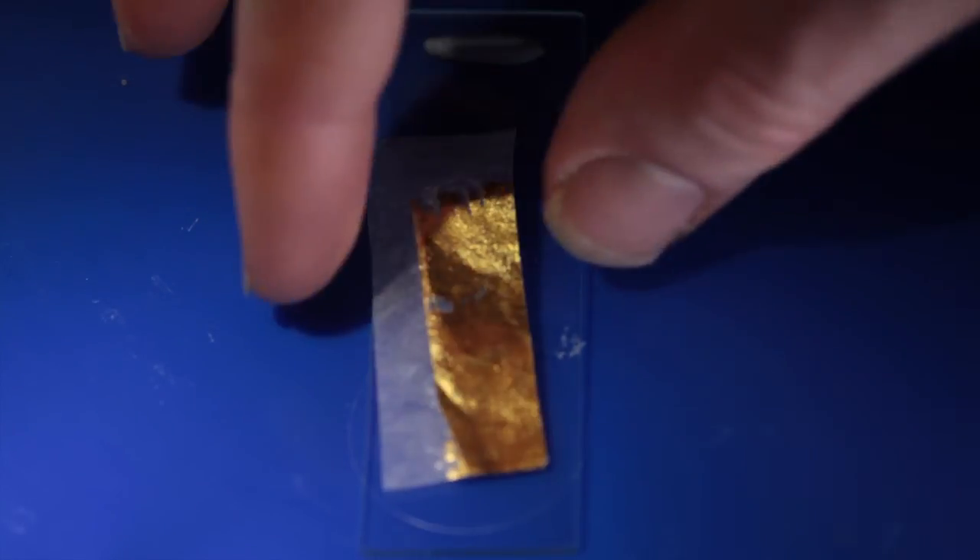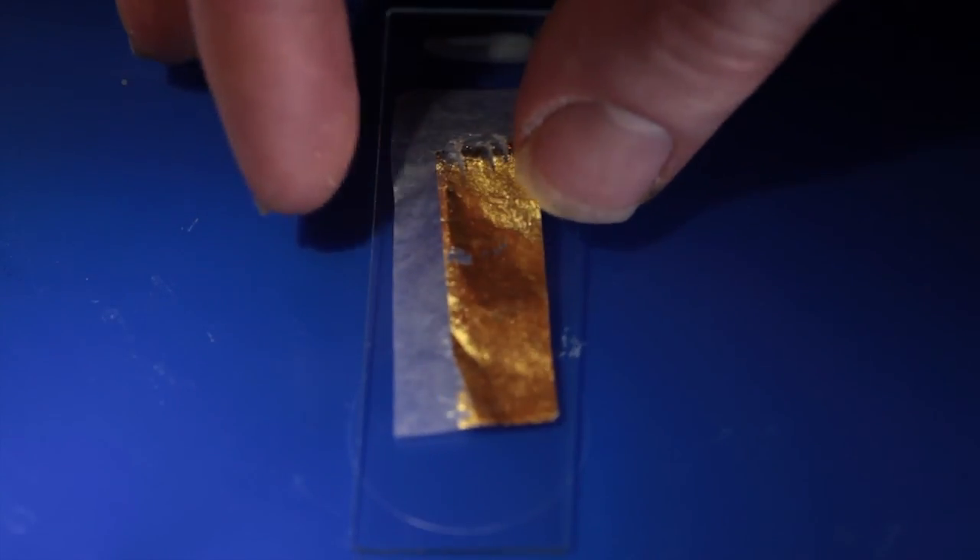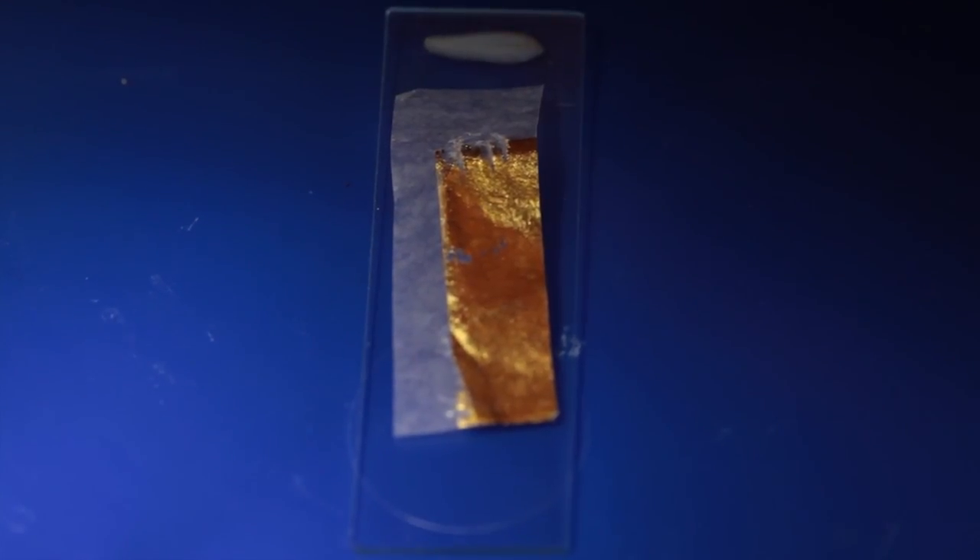Place a microscope slide in a plastic or wooden tray to capture any spills. Prop up one end on a piece of plasticine, and place a piece of gold leaf on it. This stuff came as transfer, so I didn't have to worry about handling the gold leaf itself, which can be pretty fiddly.